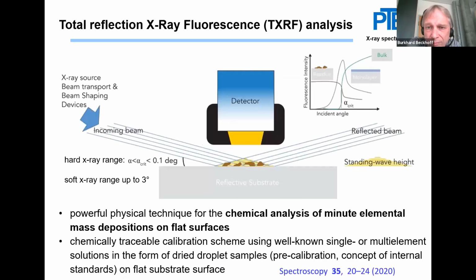For the introduction, just to recall the topic, and you're all very familiar with this, I took a picture from the spectroscopy article, and I'd like to put emphasis a little bit on what we actually do when we talk about TXRF analysis.